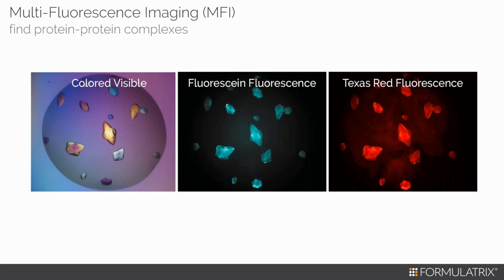and then mix them together, let them sit for 5 minutes to give them time to bind to each other, and then set up the crystal plate. Now when you get a crystal, and if the crystal shows up in both wavelengths, you are certain that the crystal is a complex and not just a crystal of one single protein.